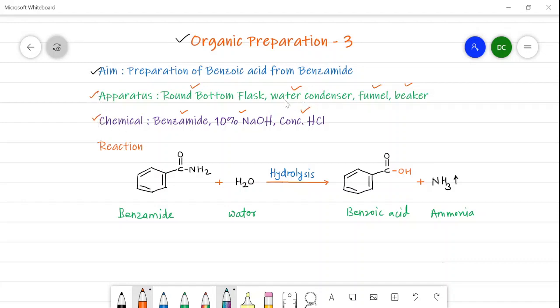A water condenser is used, which indicates there is a heating condition in this preparation. A 10% NaOH is used along with concentrated hydrochloric acid. This hydrochloric acid is used to neutralize the excess amount of sodium hydroxide as well as to convert the salt into the product.